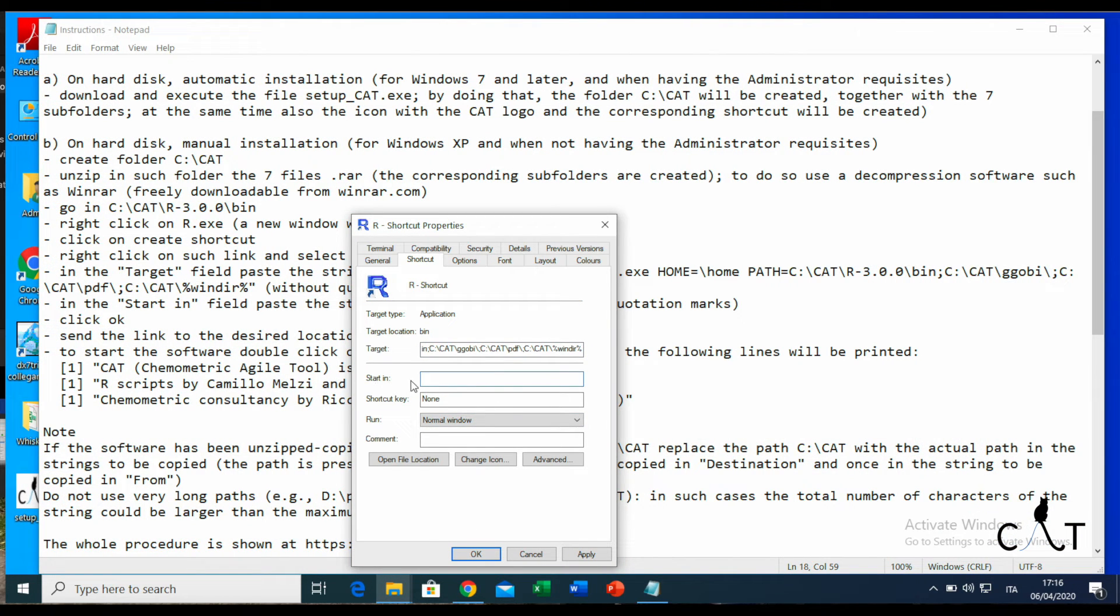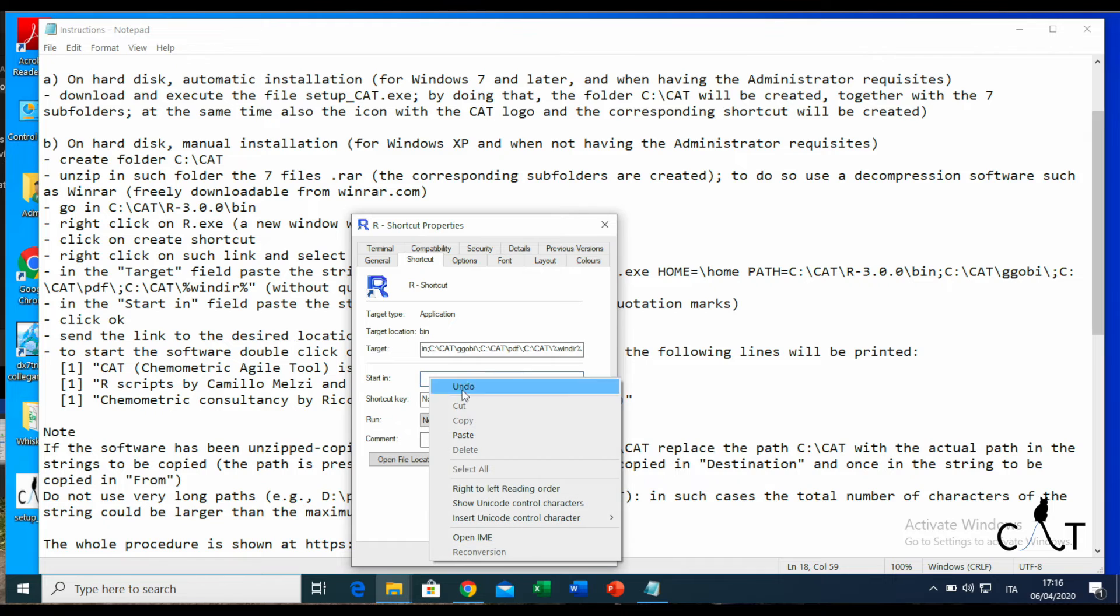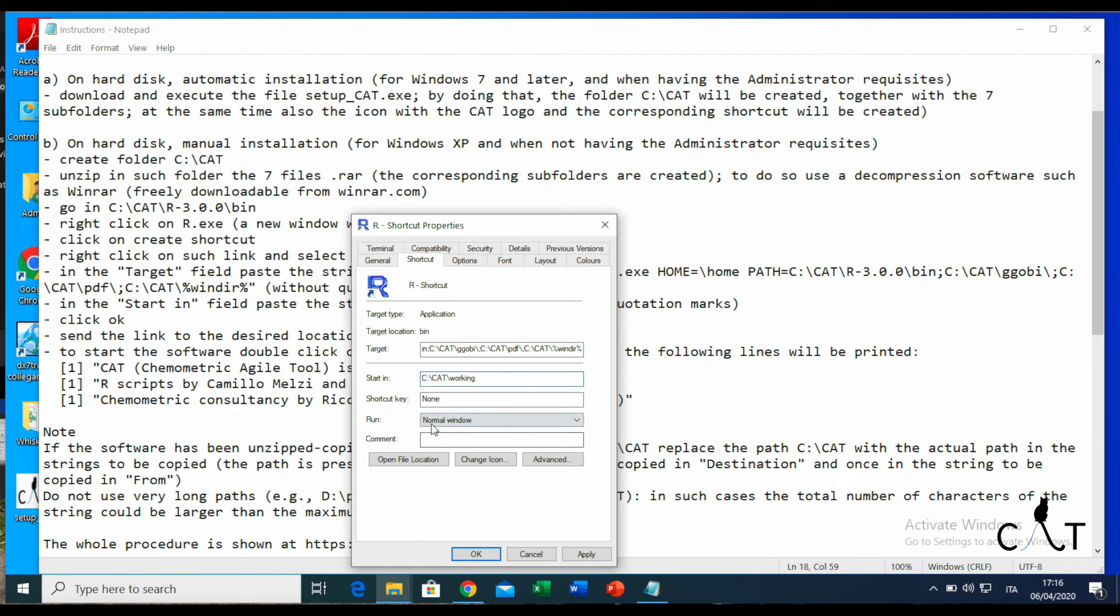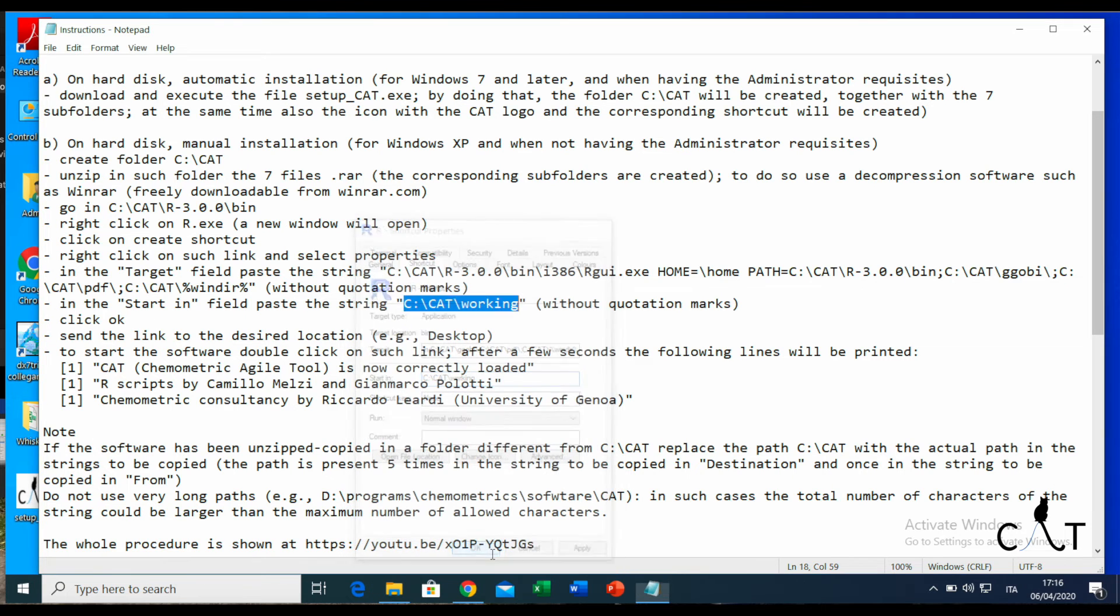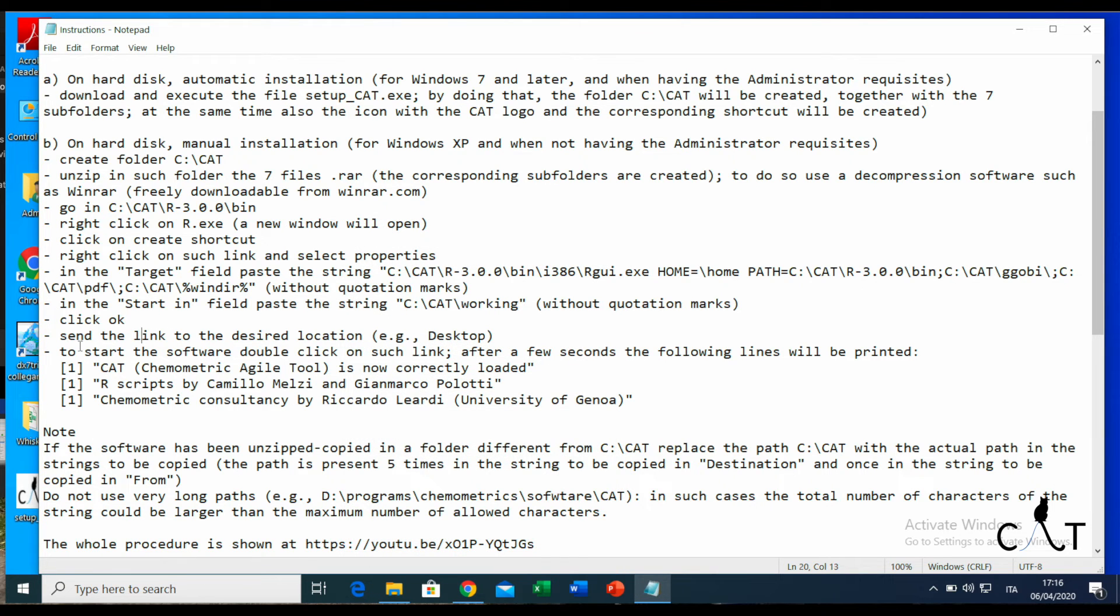And again, we paste it like this. Then we click OK.